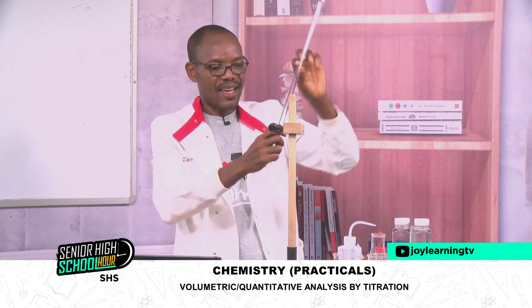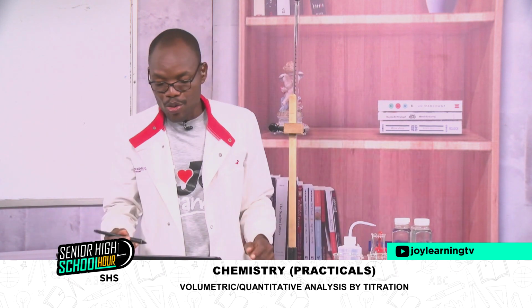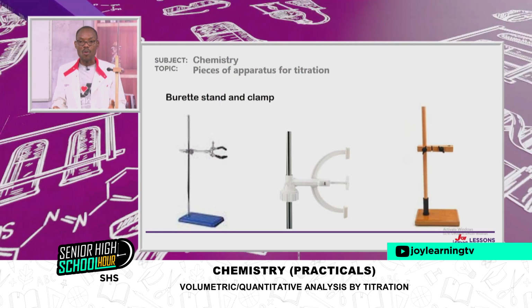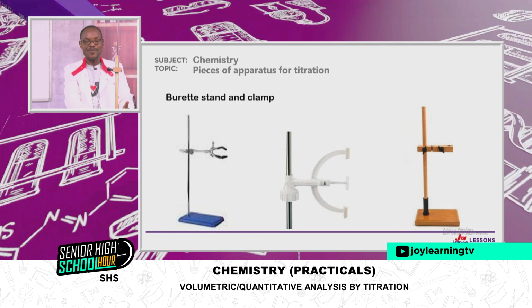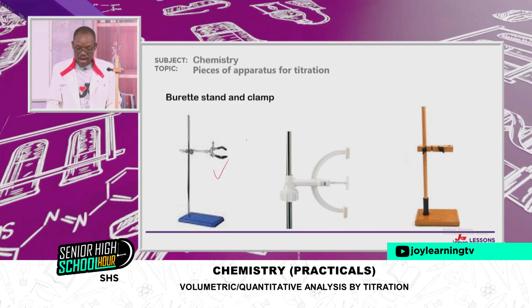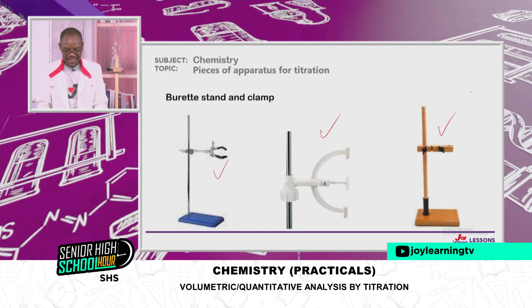So my burette stand will hold the burette in place. And the stand, as you can see on your screen, comes in various forms. We can have the metal one. We can have the wooden one. As you can see, I like the wooden one a lot, so we'll be using the wooden one. In your school, if you have this one, no problem. If you have this, no problem. But here we are using the wooden one, as you can see.